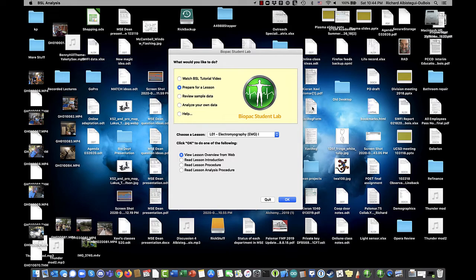Hello, this video is to help people learn to use the BioPack BSL Analysis software. Now, first of all, let me quickly explain the difference between this and the BioPack Student Lab software.